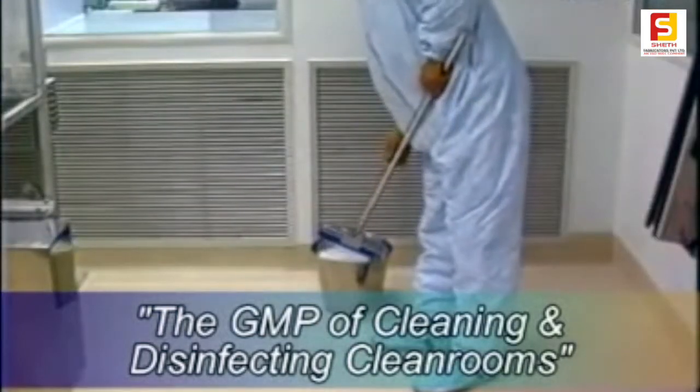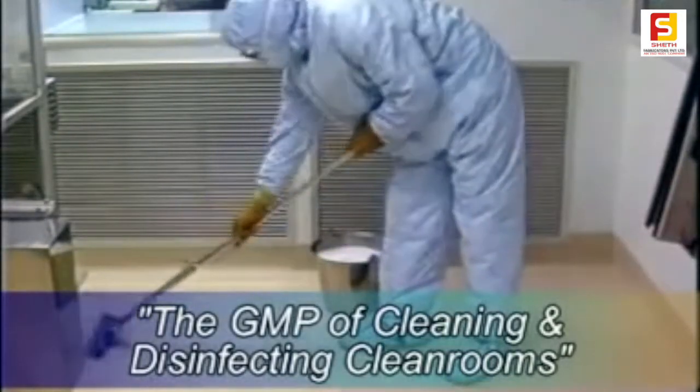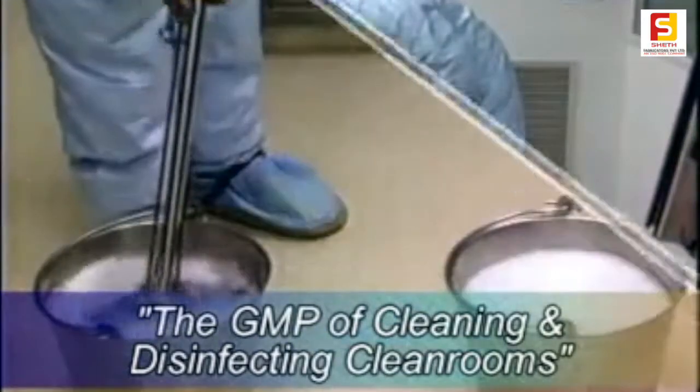The one-bucket system uses a single bucket of cleaner, disinfectant or germicidal cleaner. The method is to apply the agent to the floor in a wet application, followed by removal with a mop or vacuum.